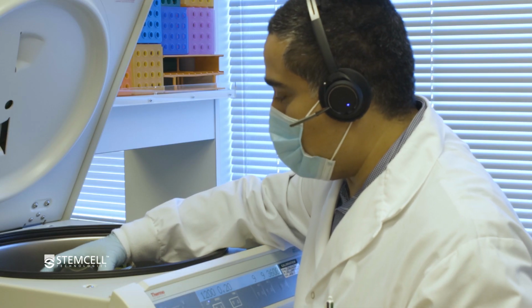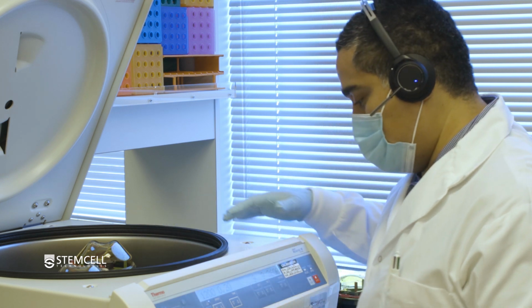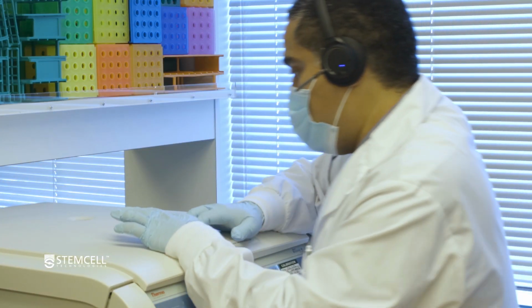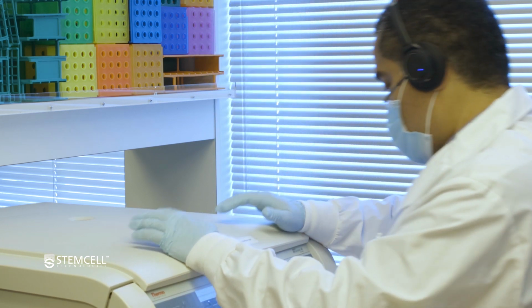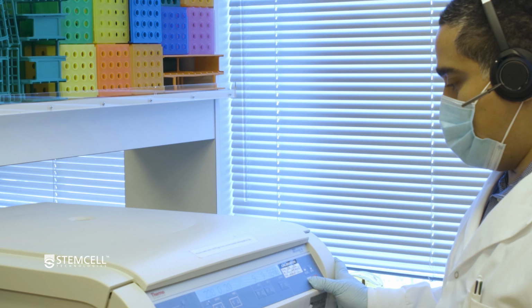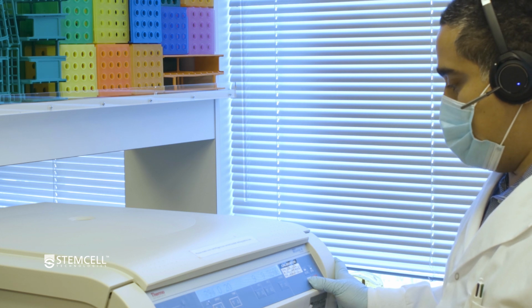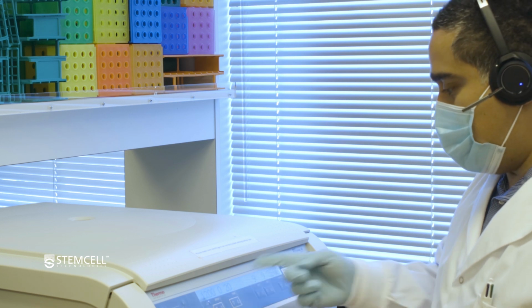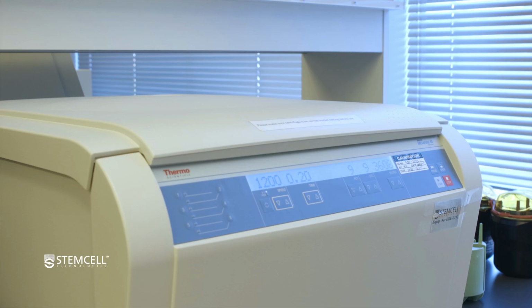Make sure, of course, that your tubes are balanced. And then you're going to want to close the lid and hit start. And it's always good practice just to wait for the centrifuge to get up to speed before walking away. There we are, 1200 times G, 20 minutes, brake on.